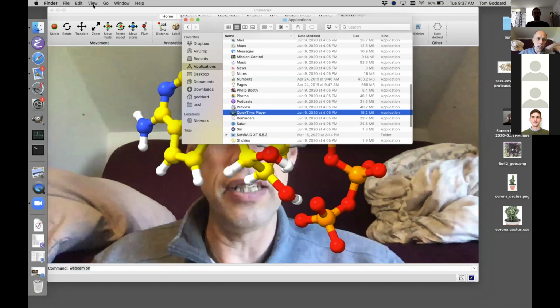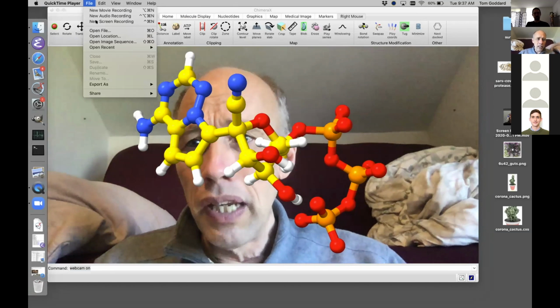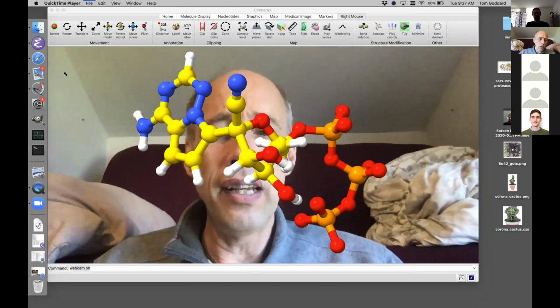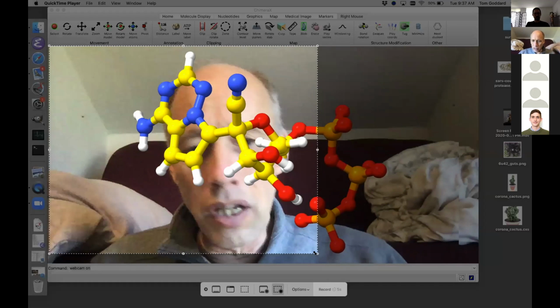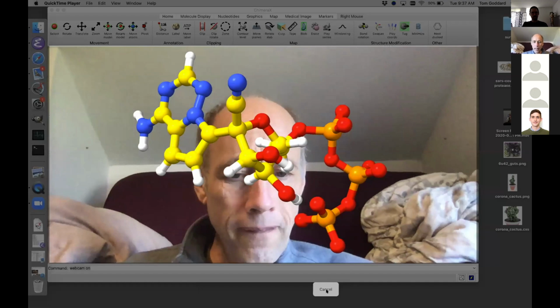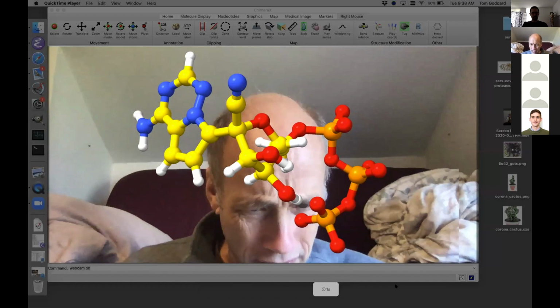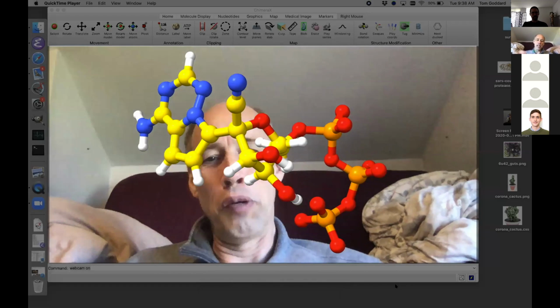So let me just show you how to do that. I just started it. I see it up in my menu. Under File, it says New Screen Recording. So I'll do that. And I'll just drag the little rectangle to record just the ChimeraX graphics region. And I'll press record. I think I have a little 5-second countdown. Boom, it started. I say, this is the triphosphate form of remdesivir.